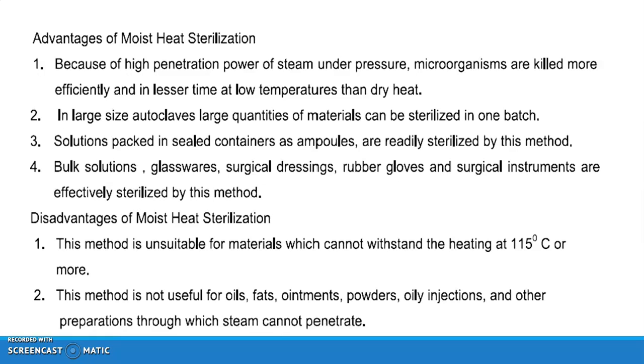And the disadvantages of moist heat sterilization. This method is unsuitable for materials which cannot withstand heating at 115 degrees Celsius or more. This method is not useful for oils, fats, ointments, powders, oily injections and other preparations through which steam cannot penetrate.